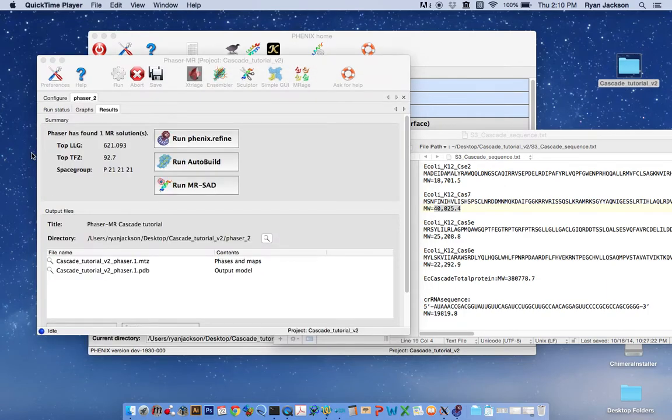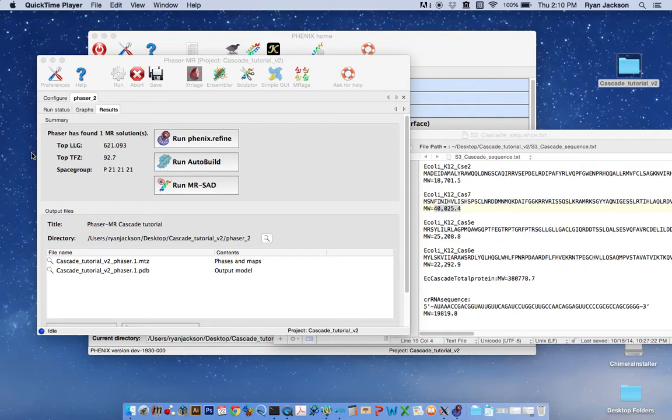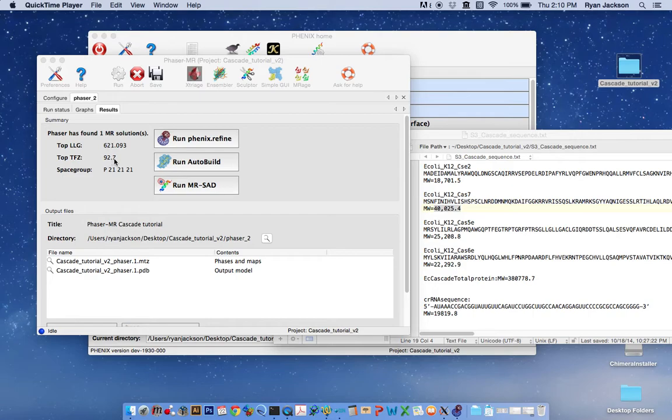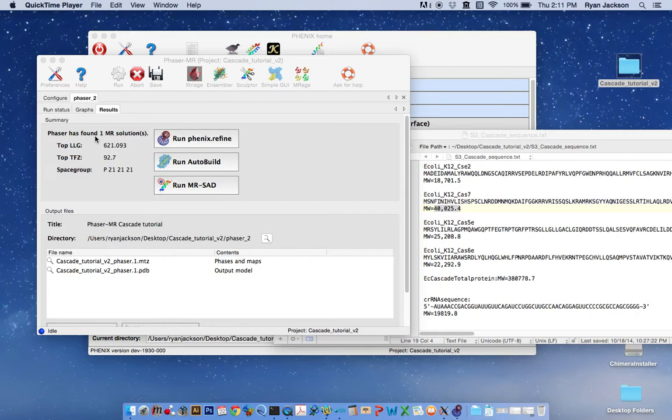After about 15 minutes or so, Phaser should find a solution with cascade. It should have placed two cascade ensembles. And this results panel is where you can kind of evaluate your results. The LLG is an important number. And so is the TFZ score. The TFZ score needs to be, or is usually considered when it is above eight, it's considered that you have a correct solution. This is also important. How many solutions do you have? In the case of cascade, we only expected to have one molecular replacement solution.